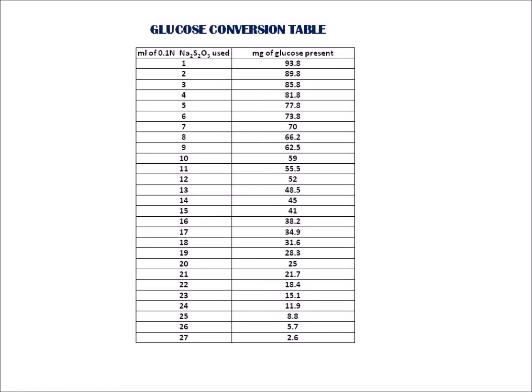This is the glucose conversion table from Scales' titration method.